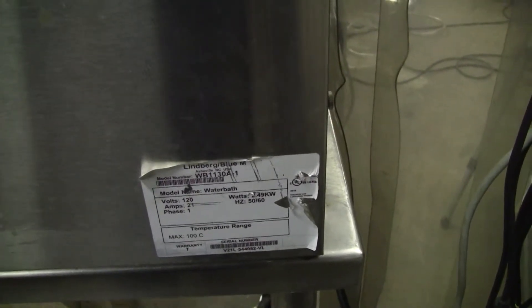Please note this is a 21 amp draw bath, meaning you should keep it on a 30 amp circuit. It will probably work fine on 20 amps, but you can't draw a lot of heat from it. It is recommended to go on a 25-30 amp circuit. It's 120 volts. Max temperature is 100°C. The model number is WB1130A-1.